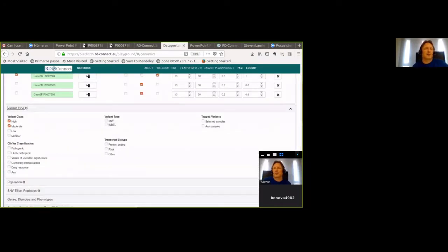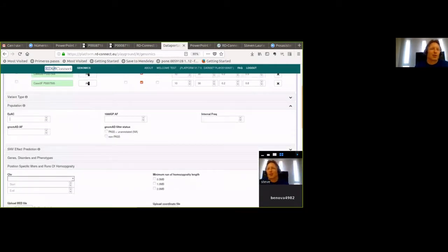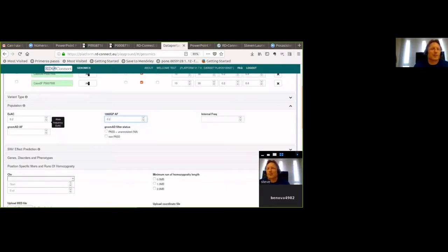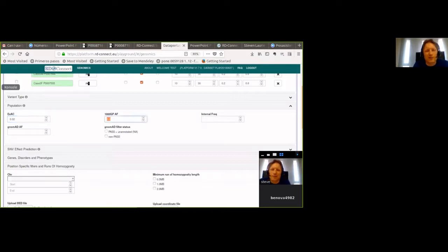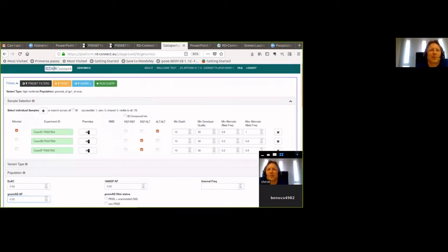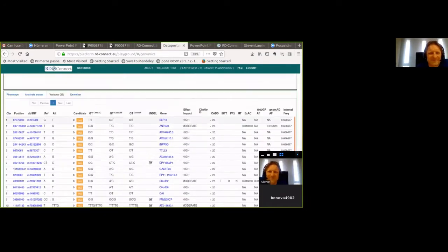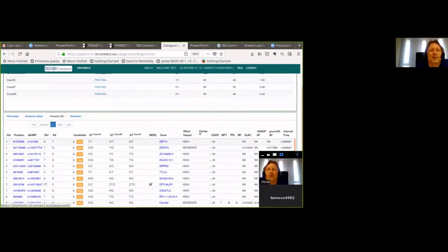Let's go back and filter by population as well. A rare disease is roughly 1 in 2000 in Europe, so we can filter by an alternative allele frequency of 0.02 — meaning one in fifty alleles. Applying all population frequency filters — ExAC, gnomAD, 1000 Genomes — we drop from 623 to just 26 variants. That's a much more manageable number.